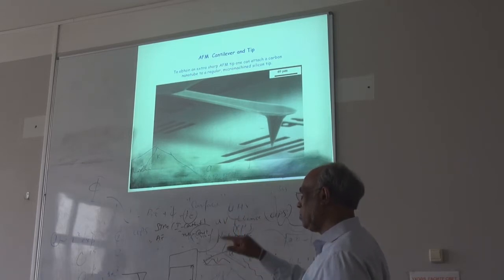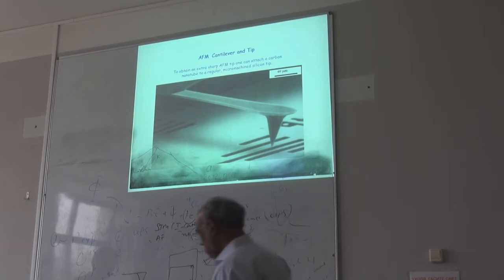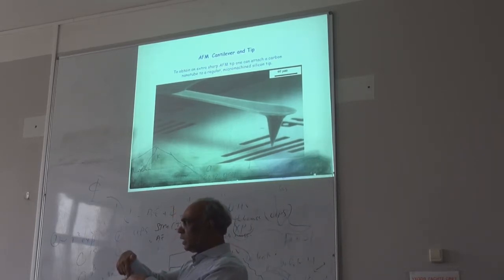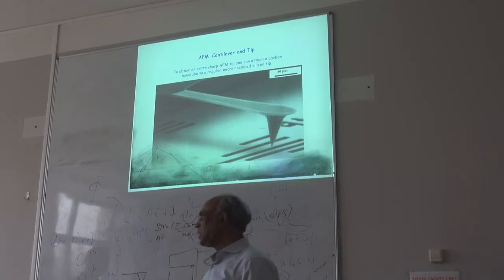They come in this small box. Usually we order like 20 at a time. And what about the using time? If you use, I'll talk about it, there's something called the contact mode and the non-contact mode. If you use the contact mode, maybe after 4 or 5 samples you have to replace the tip. With non-contact mode, you can use it for like 10 to 20 times.